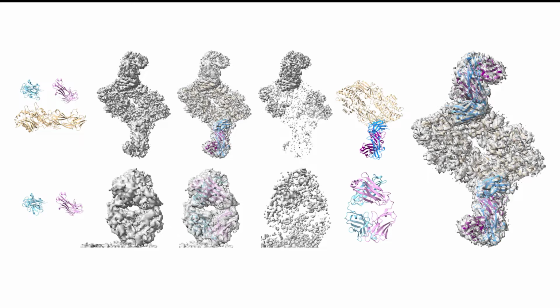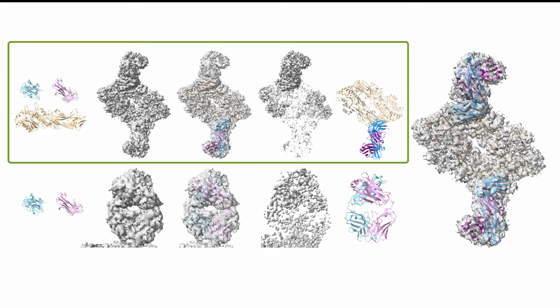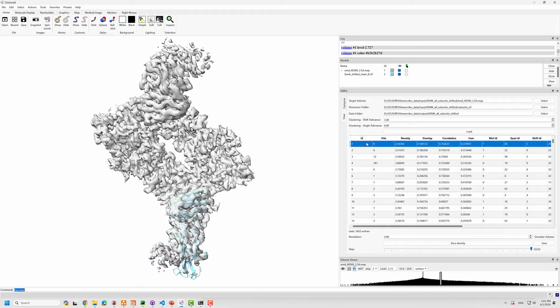Second, we show compositing multiple structures. As a demo, 3 unique subunits of PDB-8SMK are fitted into its cryo-EM map. At the first round, all 3 subunits get in. The 2 copies of the bigger subunit and 1 copy of each smaller subunit are identified upon the user's inspection.